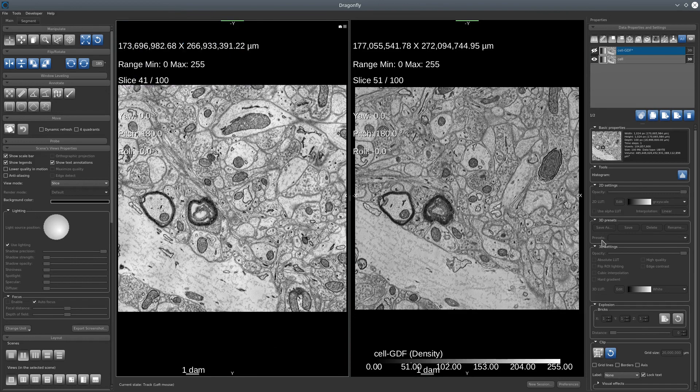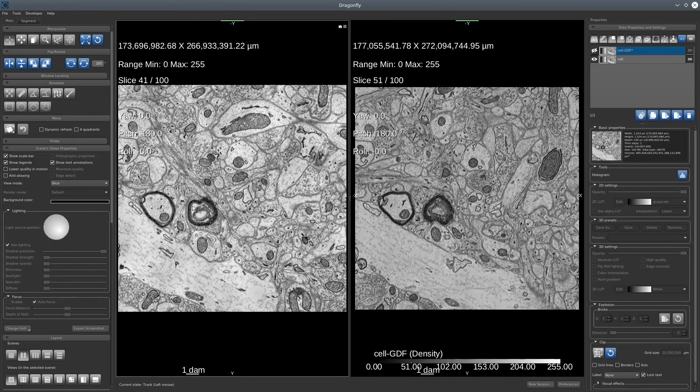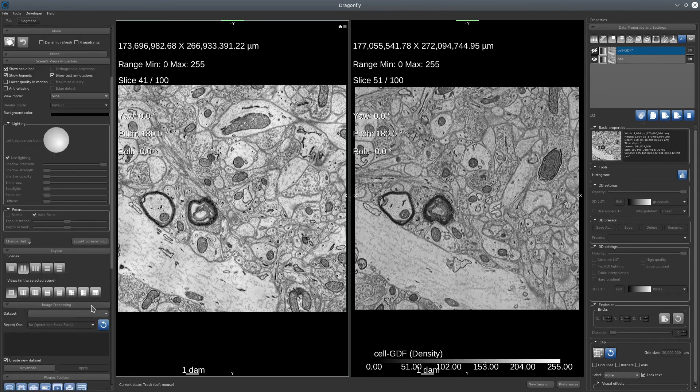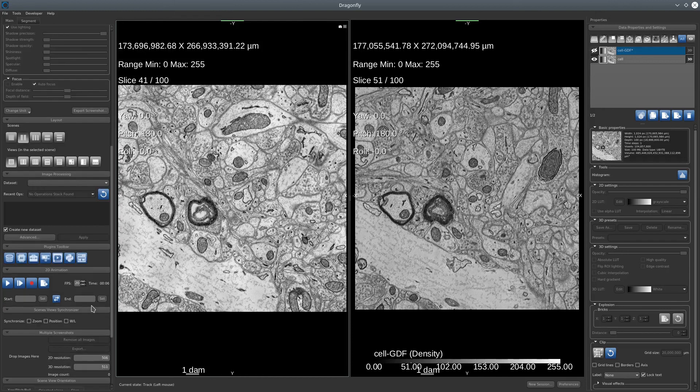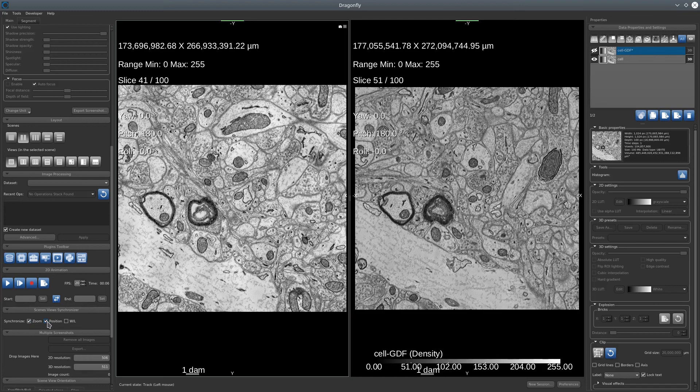To synchronize my slice, we'll just go in the scene view synchronizer and select zoom position. And do the same with the other view.